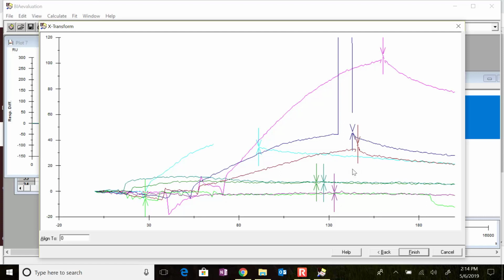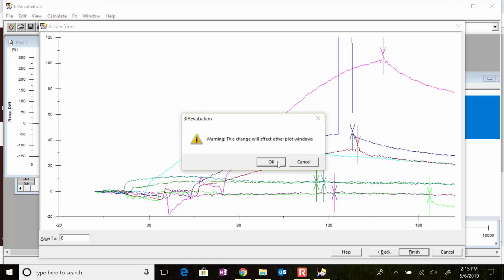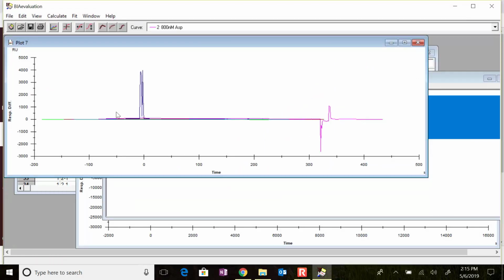Now the other thing is you shouldn't be aligning on a bubble, but let's see if this will actually line up with everything else. And then finally this green one again. This might be the end of the shark fin. We'll see if that works. I've found all my colors. I've tried something to line it up, and now I'm going to say finish. Oh, and I have other plot windows open, but I'm just going to ignore that.